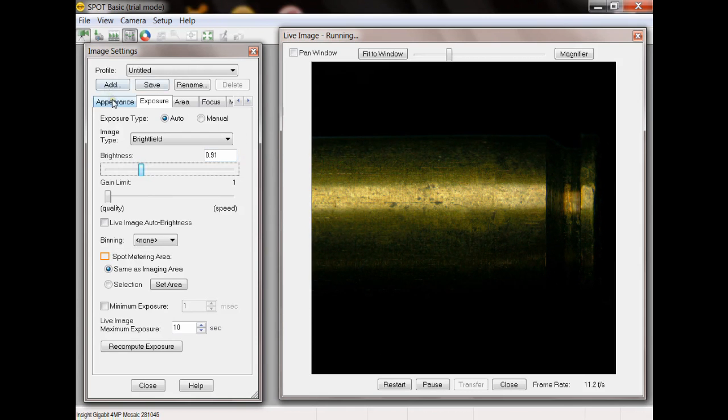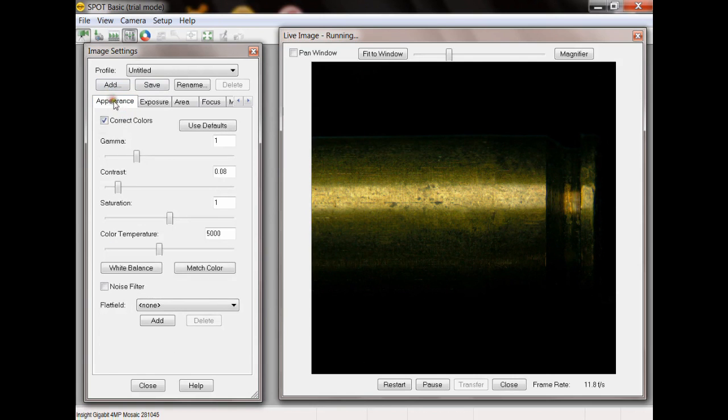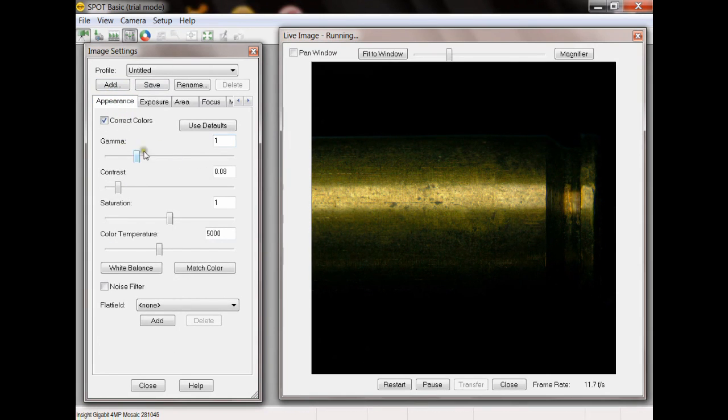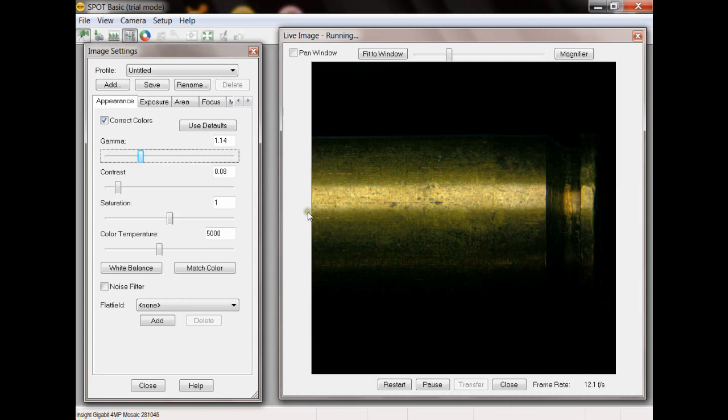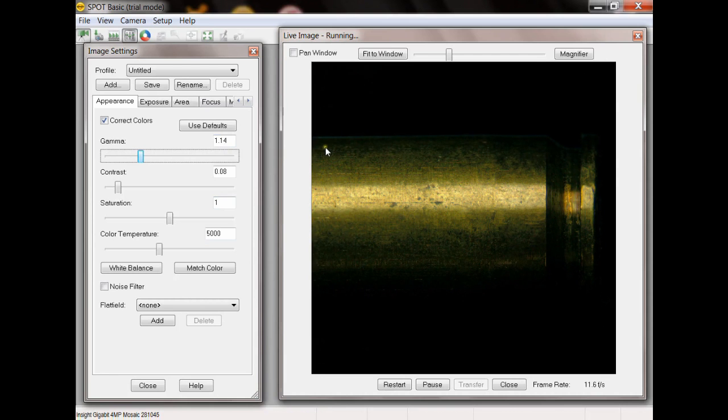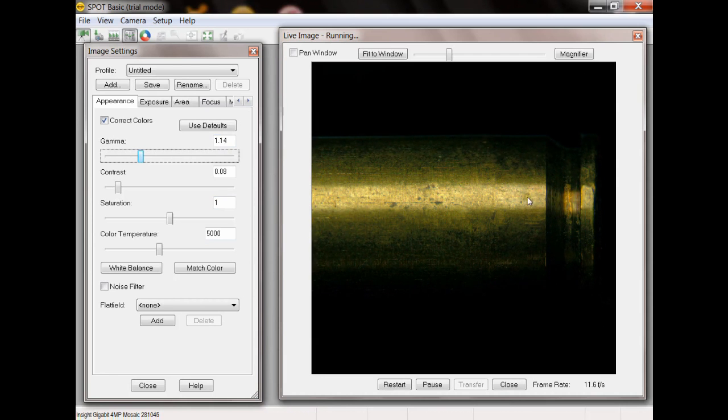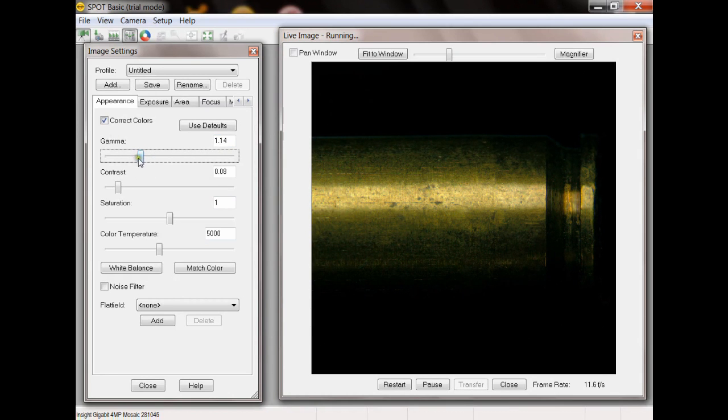And what I do is I go to appearance and I'm going to adjust my gamma up. As I increase my gamma up, what's going to happen is it's going to increase the pixels that are darker without causing the exposure to change for the pixels that are bright, which is going to bring more detail to these darker regions.